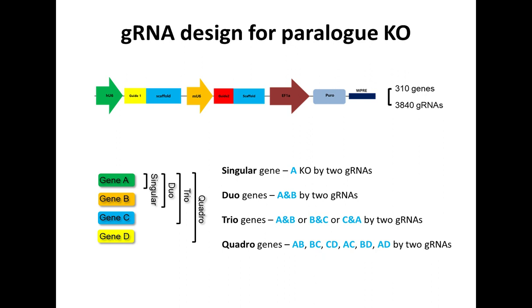And to also achieve a higher discovery rate, we designed our gRNA in a way that we can put two gRNAs at the same time. And this allows us to knock out genes in an interesting way. So as you know, when vertebrates evolved from invertebrates, there has been full genome duplication 2 times. So this means that in fly, one gene, one function is true, almost.